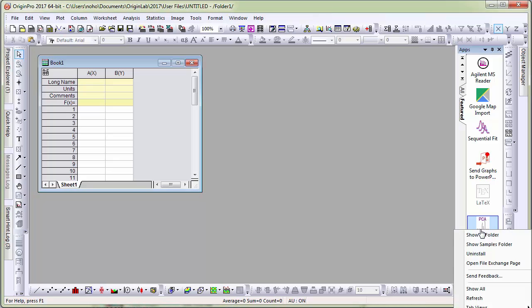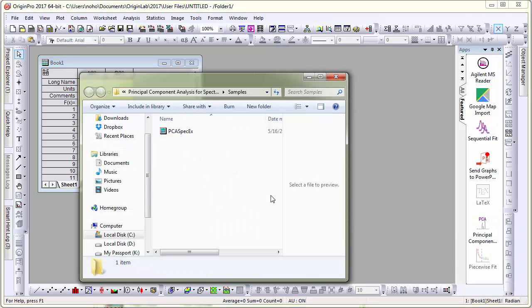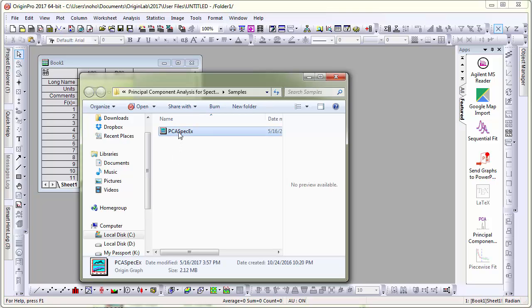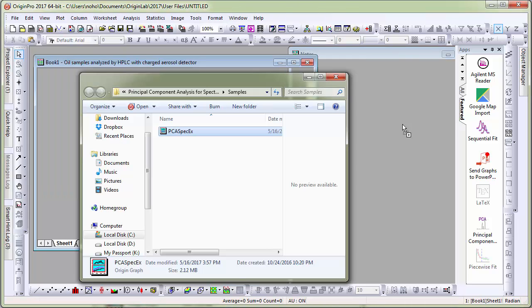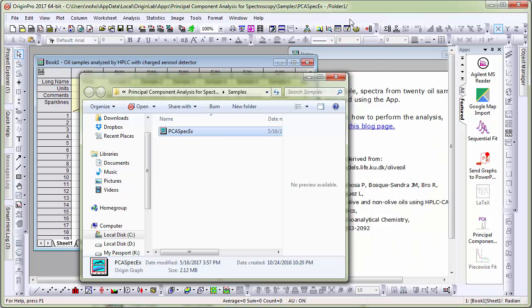When I right click on the icon, I see a context menu from which I can select Show Sample Folder. This opens a folder with a sample project that has been included with the app. Let me drag and drop the file onto Origin to open it.